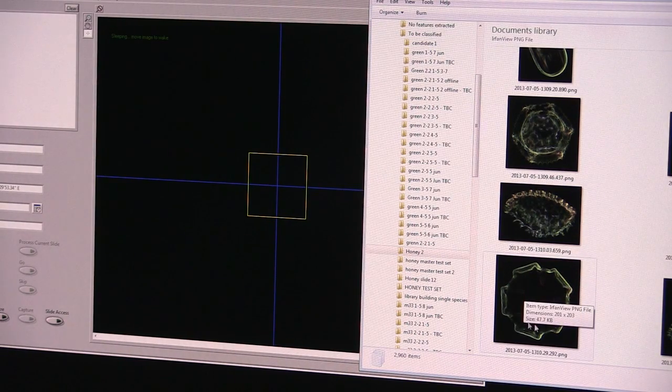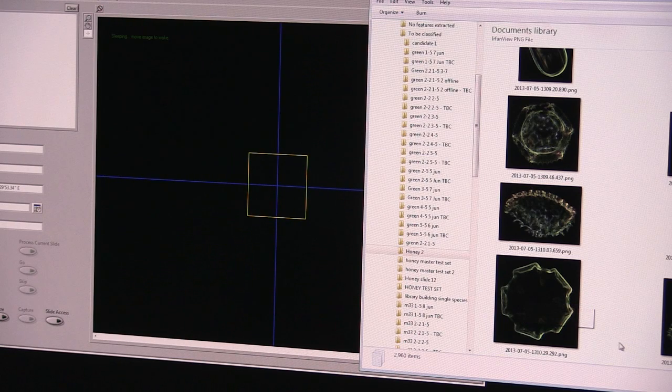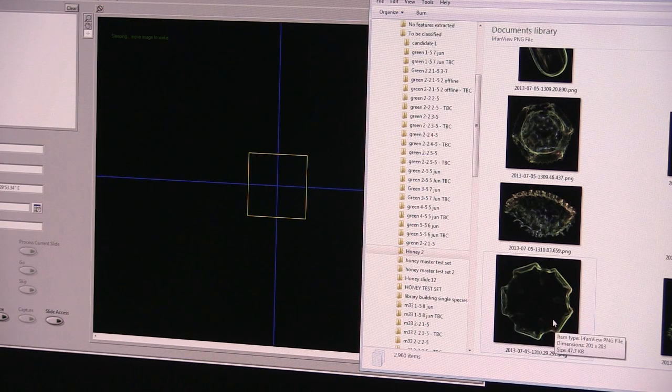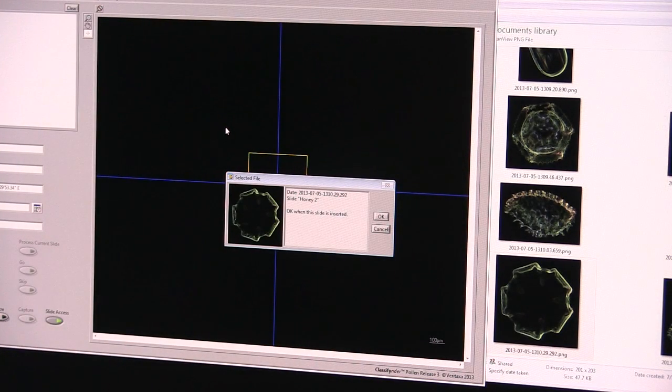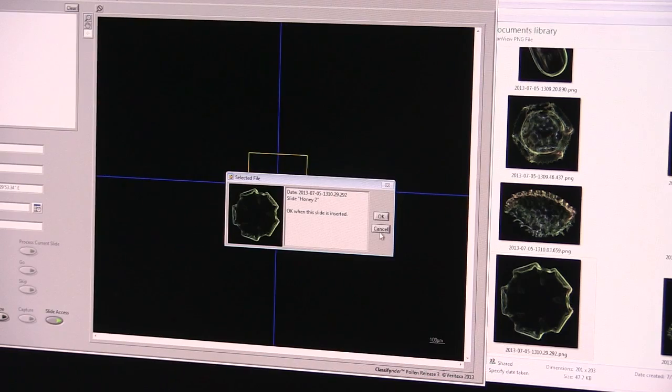Say for example we wish to revisit this particular pollen image here. So to do that we drag and drop it into the classifier finder and then it prompts us to ask for the slide.